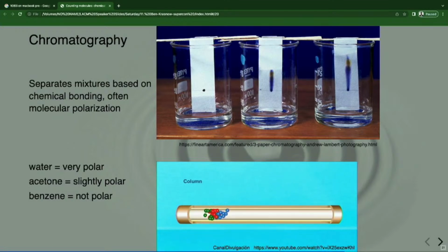And this works all the way down to parts per trillion levels. You can put in a mixture of compounds where one compound might be 100,000 times more represented than another, and when they come out the end of the tube, it perfectly separates them. So you can detect things with a contrast ratio of billions to one, even, if your detector is able to do that.